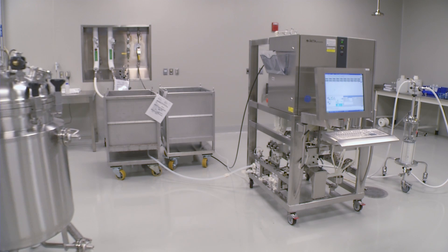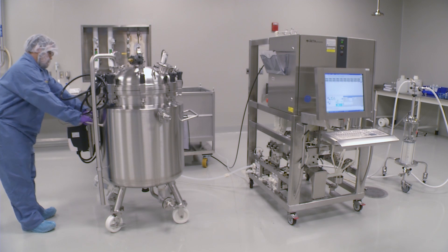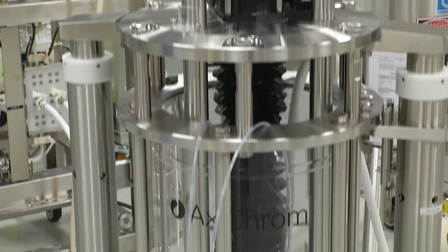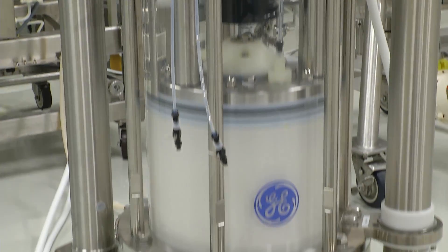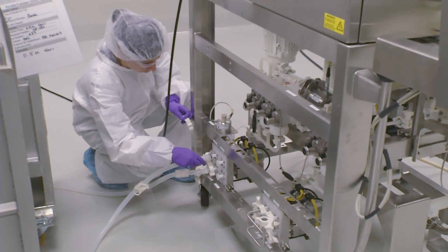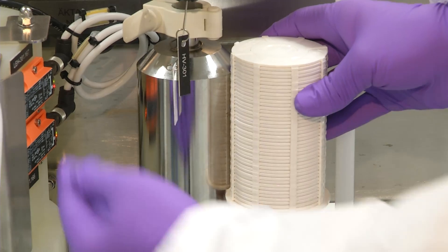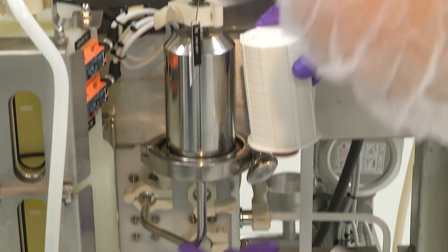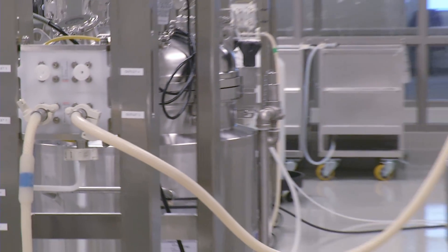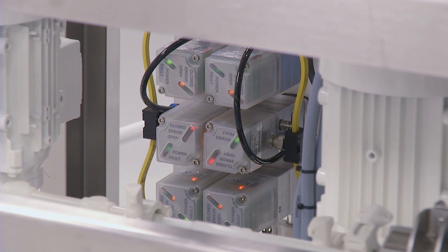In our process, which uses ion exchange and hydrophobic interaction chromatography, the chromatography equipment is housed on a skid to make it compact and mobile. The main part of the apparatus is a glass column filled with resin beads, but we also have pumps to move the clarified lysate through the process, a supply hose and port to feed the column, a pre-filter to remove any remaining particulates — usually solid cell debris not previously removed — before the clarified lysate enters the column, an exit port for the processed solution, and auto-switching valves for directing processed solution to either waste or collection.